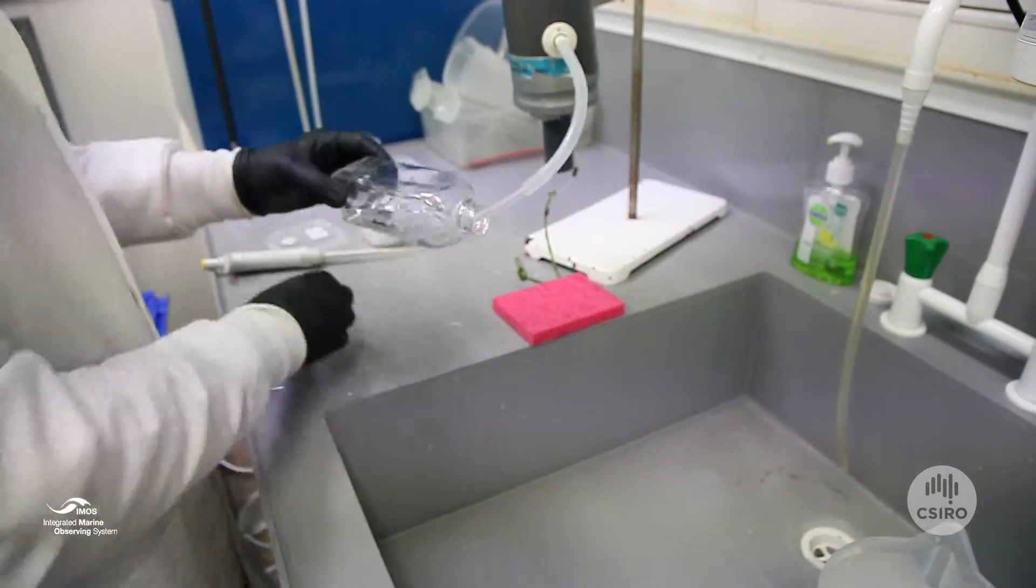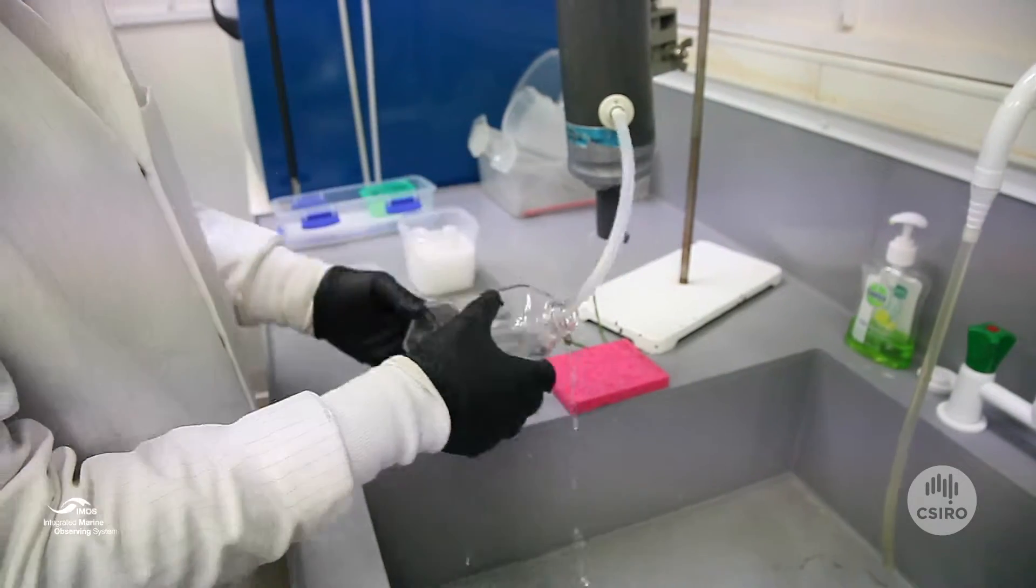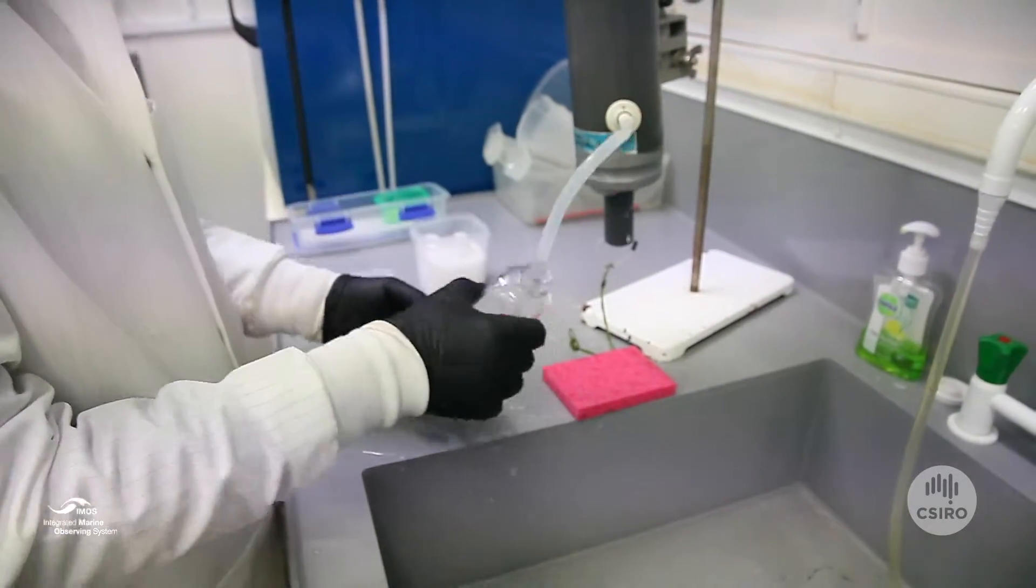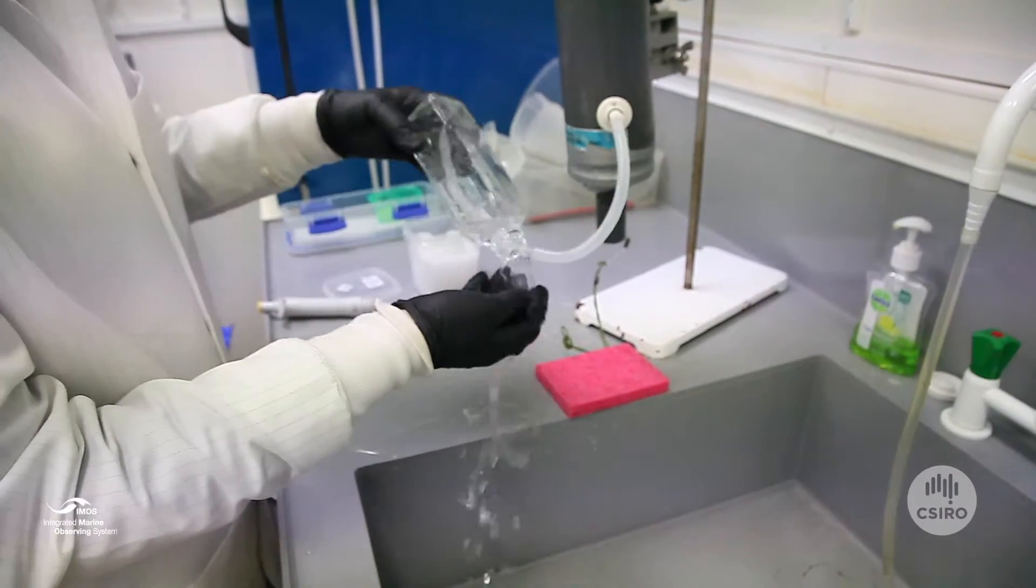Put the tube in the bottom of the square bottle and rinse the bottle three times, keeping the tip of the tube at the bottom of the bottle. Once, twice, and three times, rinsing through the lid.